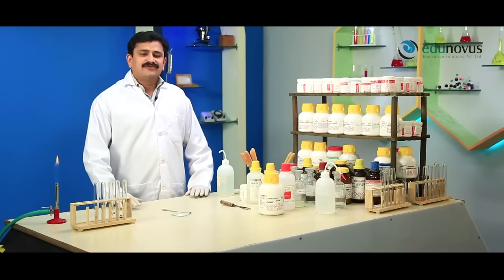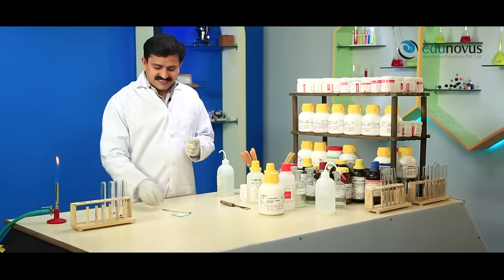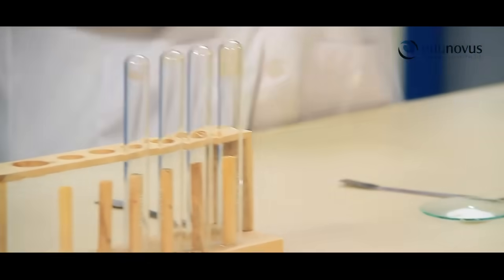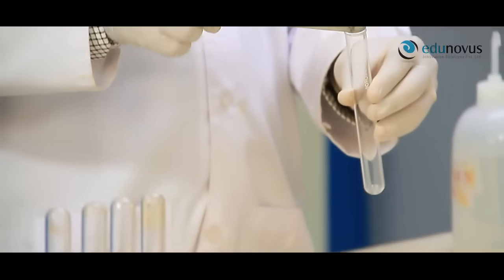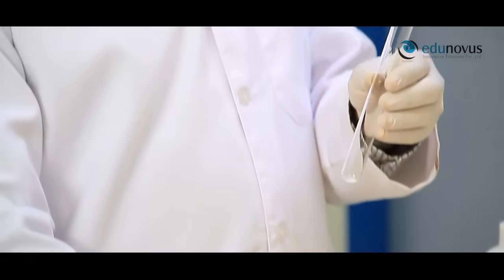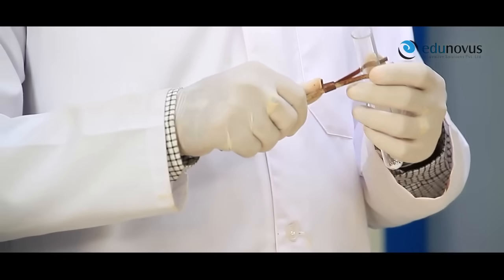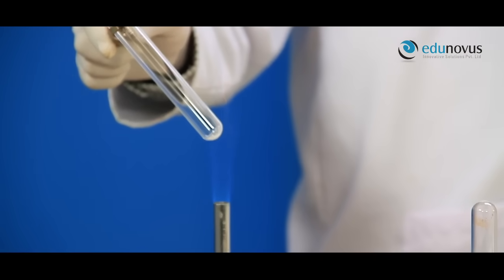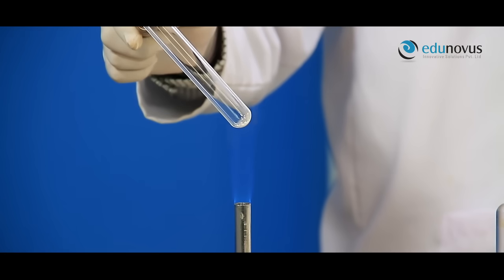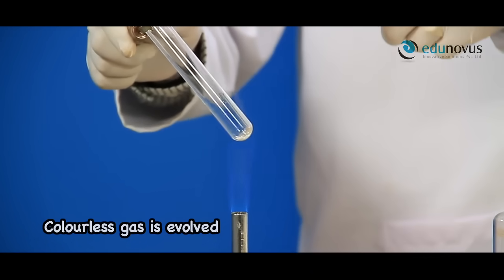Let us see the action of heat on the given salt. Take a small amount of given salt in a clean and dry test tube and heat it using Bunsen flame. Here you can see the liberation of colorless vapors.